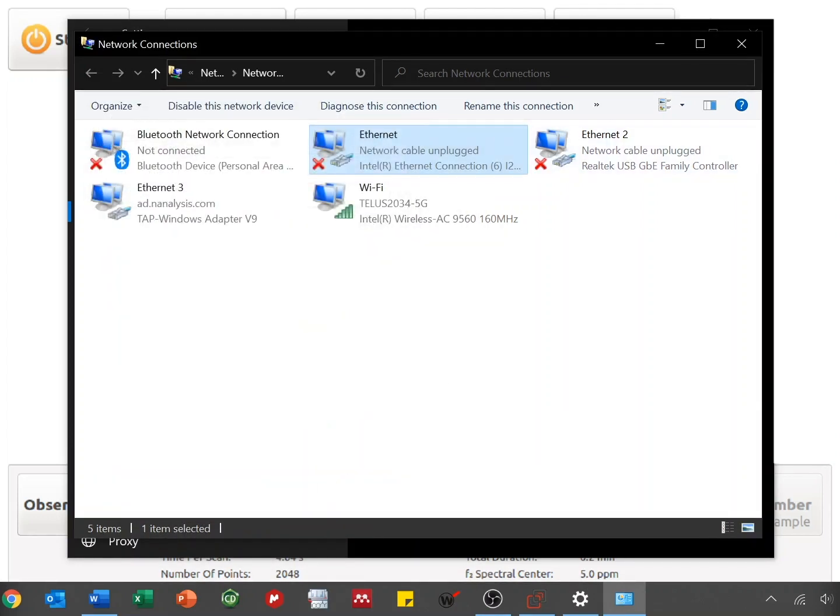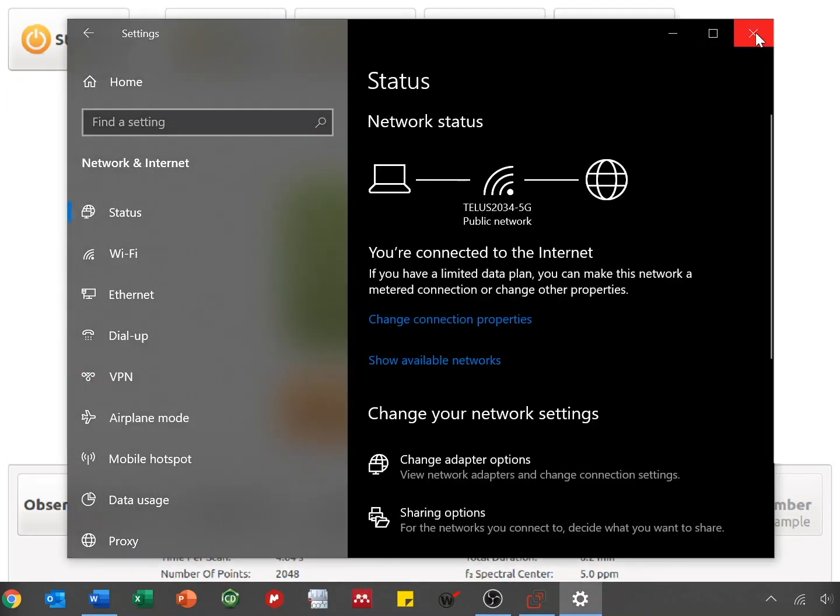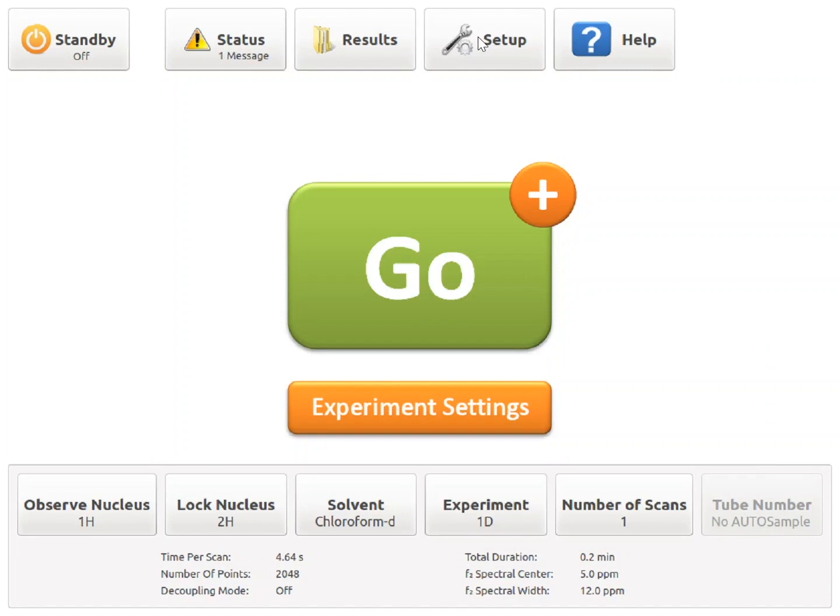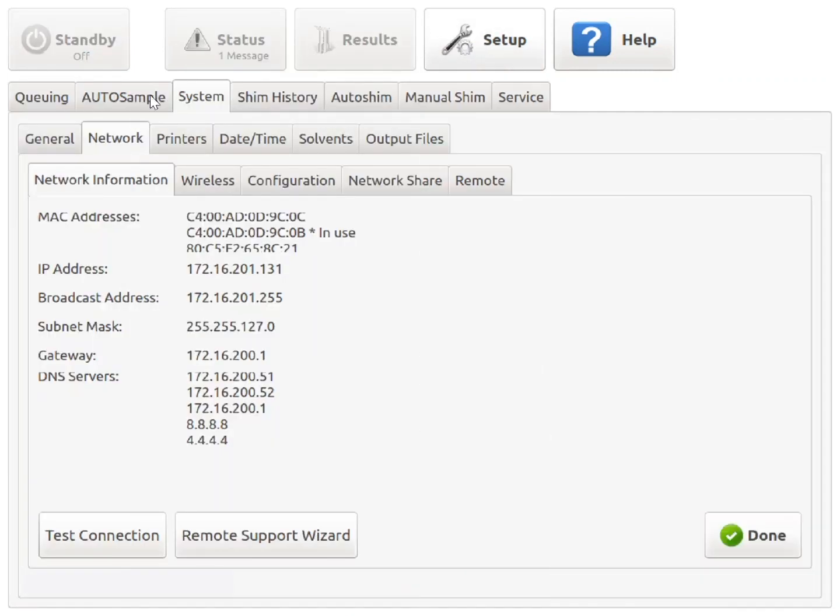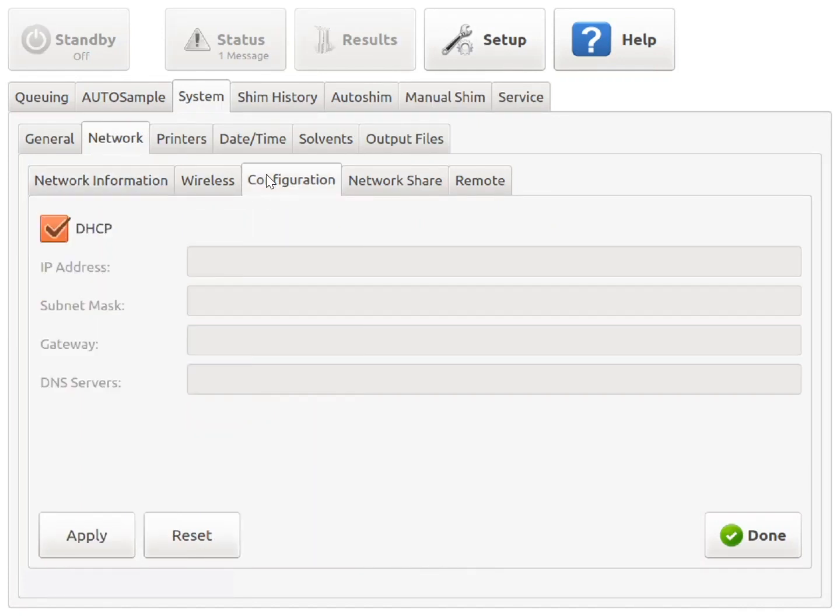Close, and you can close these windows. On the instrument, navigate to Setup, System, Network, and Configuration.